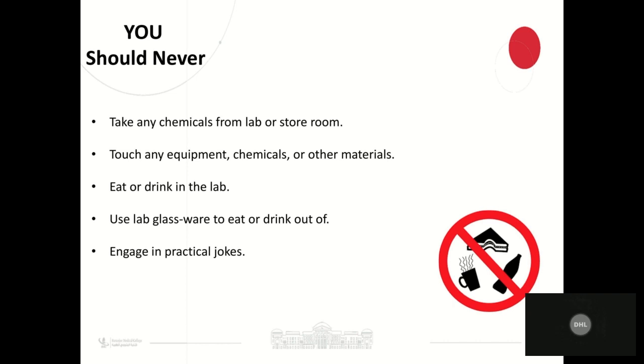You should never do the following inside the lab: take any chemical from the lab, touch equipment, chemical or other material, bring any food or water inside the lab, and engage in practical jokes.